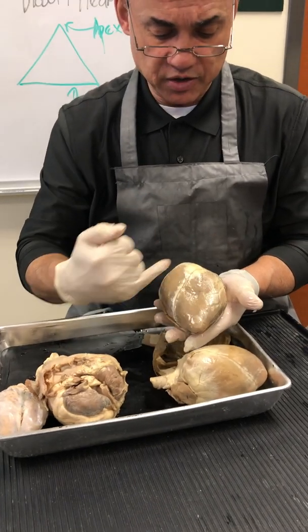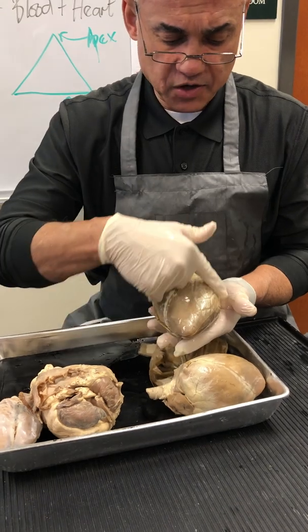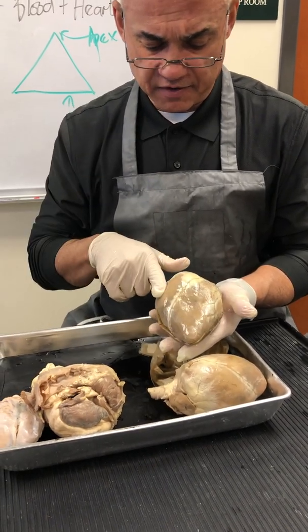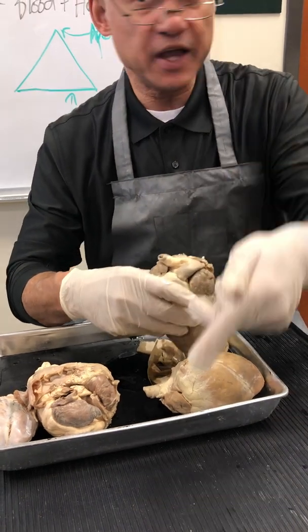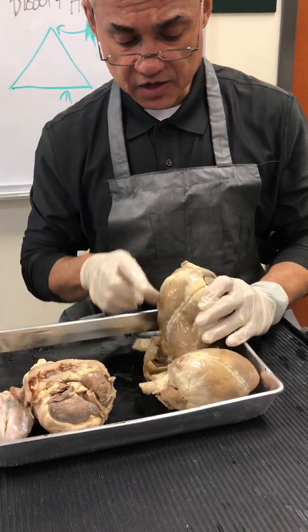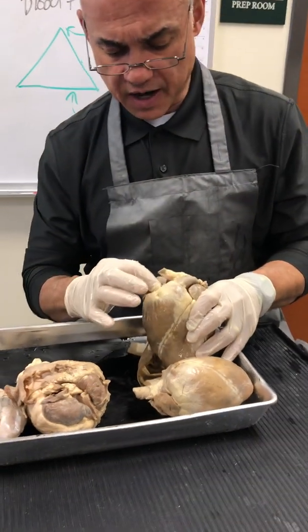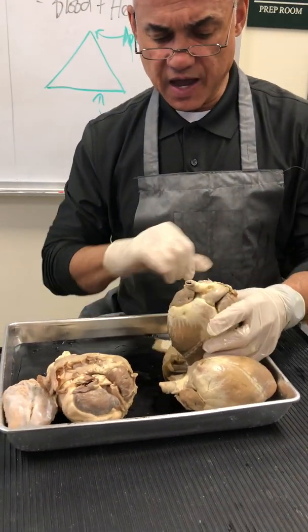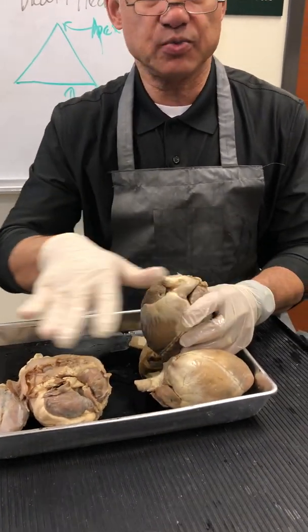So again, notice point of reference. Anterior interventricular, apex, left ventricle, right ventricle. So I can see all of the structures again before I start looking at it, right? So right ventricle, pulmonary artery, aorta, right atrium, left atrium. There I can see the superior vena cava. So you practice with this, all right?